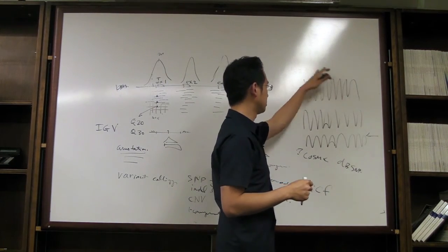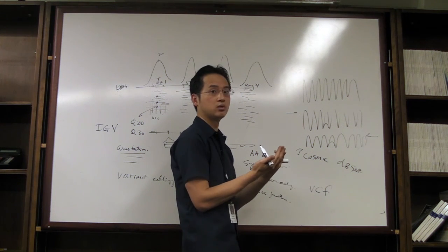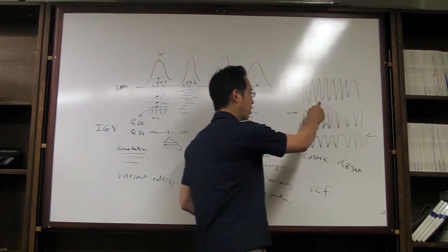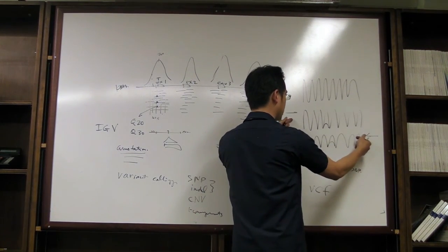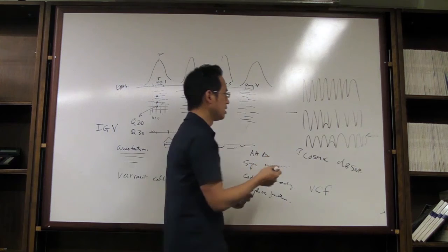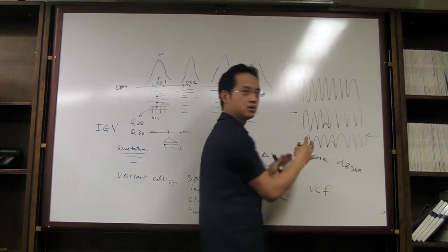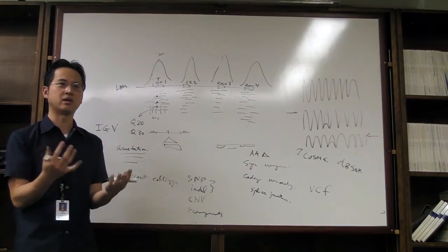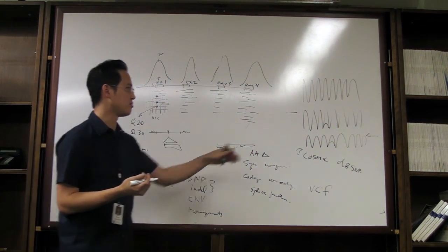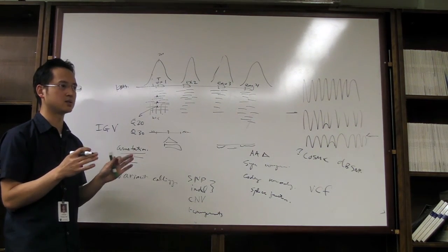So no more is this, where you have to look at the analog raw data. It's going to be tabulated, basically almost digital, the data that comes out. But the practice is the same, right? In the old days, we have a reference. We have forward and reverse read. We have to align it, right? You have to align it to what you think you're trying to read. And then you make the variant calling here. And then you have to say, oh, what base is it? What mutation is it? It's all the same process, but you have to now let go of that and let the computer handle all of that, which is a nice thing, right? And so that's the main difference between interpreting a Sanger sequencing trace versus next-gen. But really, in the end, it's the same process.